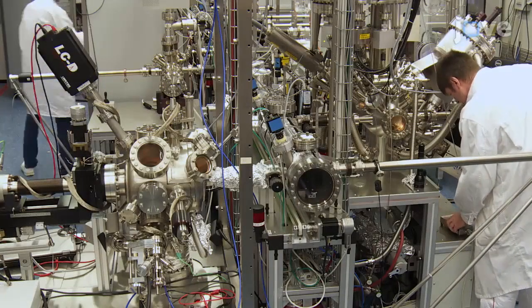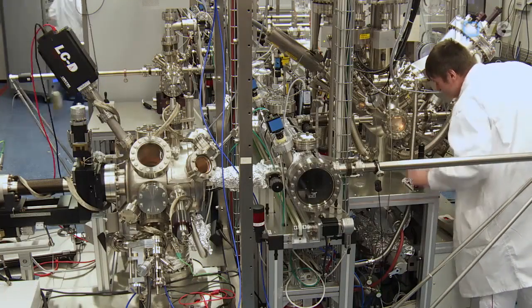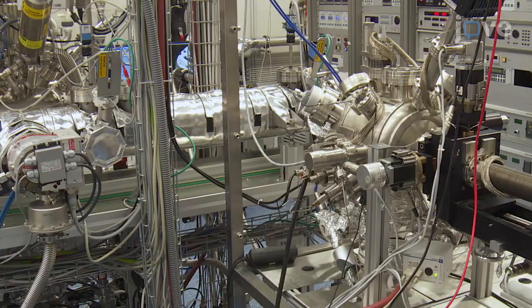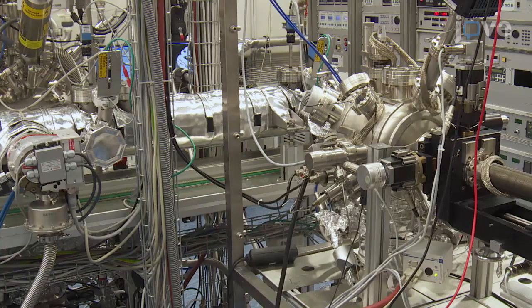The experiments are performed using the lab station at the Joint Research Center Karlsruhe. The lab station allows preparation of films and analysis of sample surfaces in situ without exposure to the atmosphere.